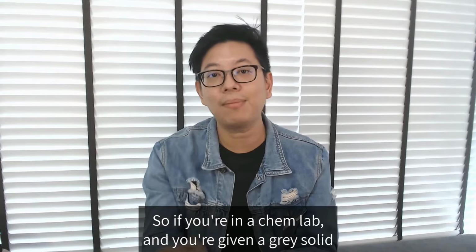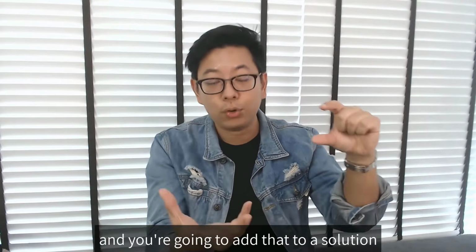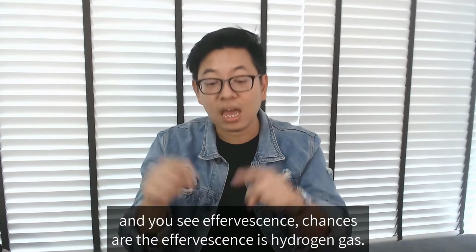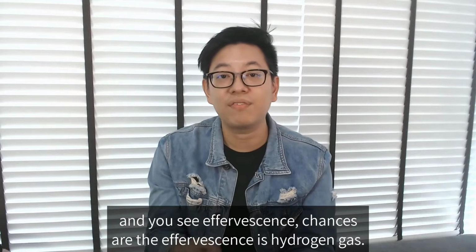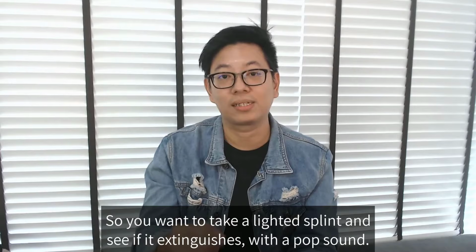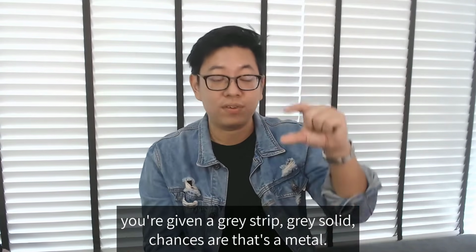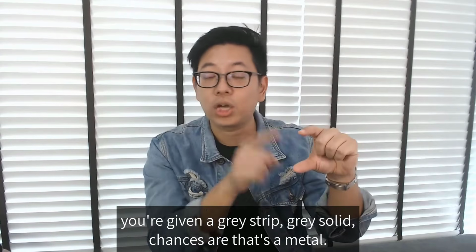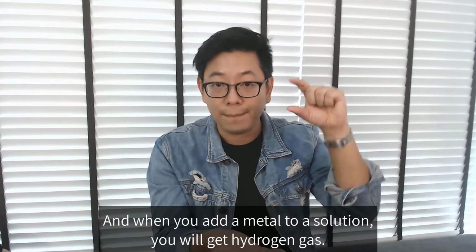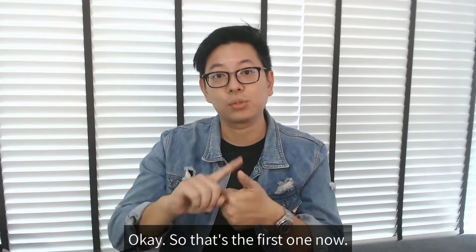So if you're in a chem lab and you're given a grey solid, or if you're given a grey strip, and you're going to add that to a solution, and you see effervescence, chances are the effervescence is hydrogen gas. So you want to take a lighted splint and see if it extinguishes with a pop sound. Alright, so once again, if you go to a chem lab, you're given a grey strip, grey solid, chances are that's a metal, and when you add a metal to a solution, you will get hydrogen gas. Okay, so that's the first one.